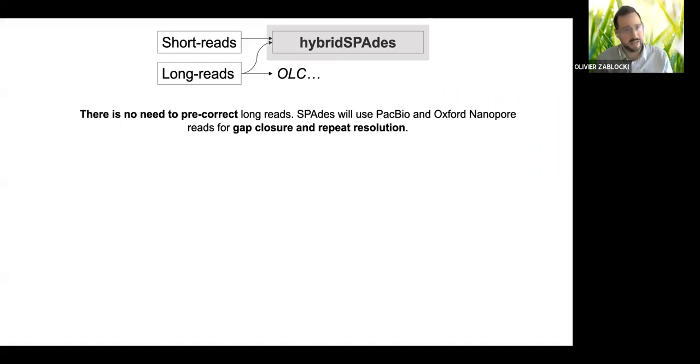I mean, it can be for certain applications that require ultra high accuracy. But if you have a 2 megabase genome that needs gap closure, it won't be a big issue, even if there are some indels and mismatches present.